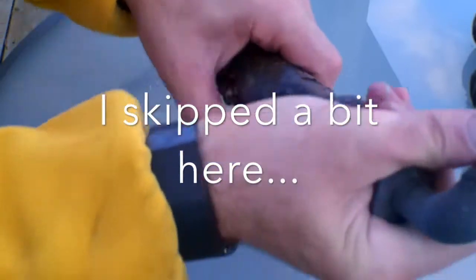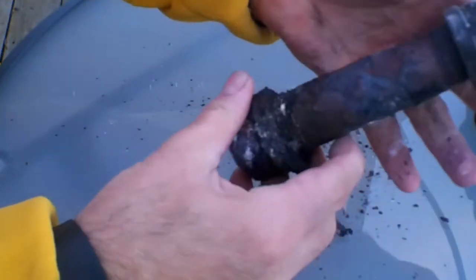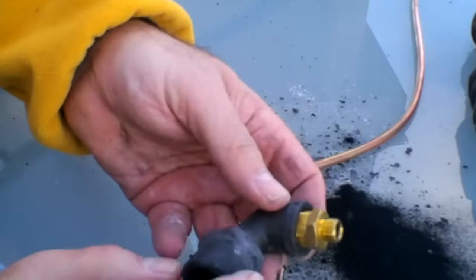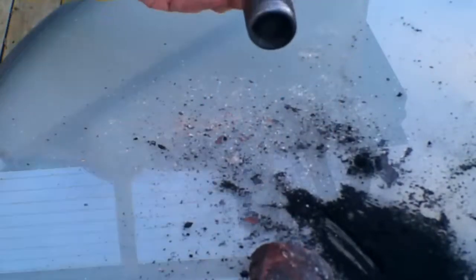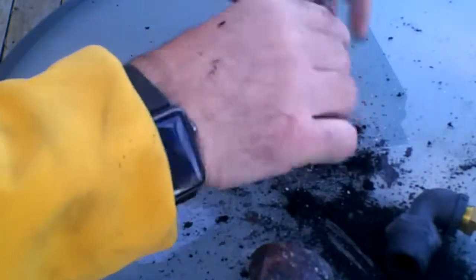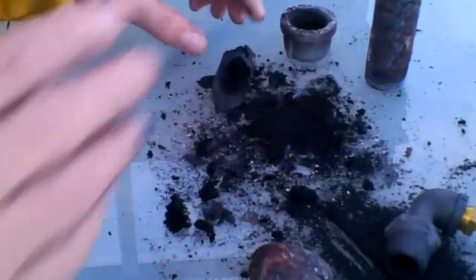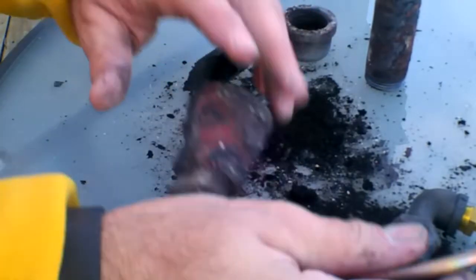Okay, so let's open our white potash first. Easier said than done. As you can see, it got pretty hot. It didn't melt anything, although I think stuff came out the bottom. Looks like my brass did not melt. Okay, the brown potash is similarly still got a fair amount of product in it. It's all melty, so I did actually manage to chemically transform the potash, at least to some degree, but it doesn't appear that I managed to smelt it.